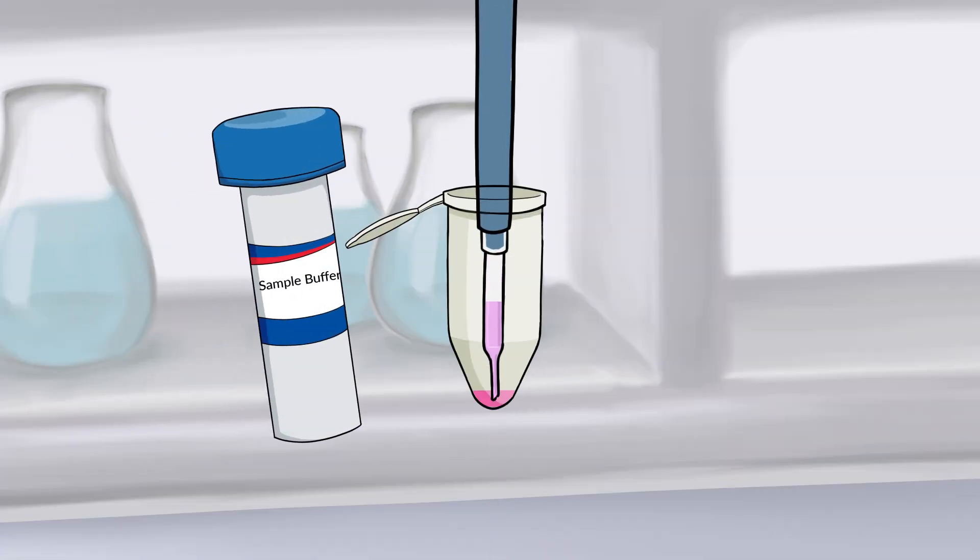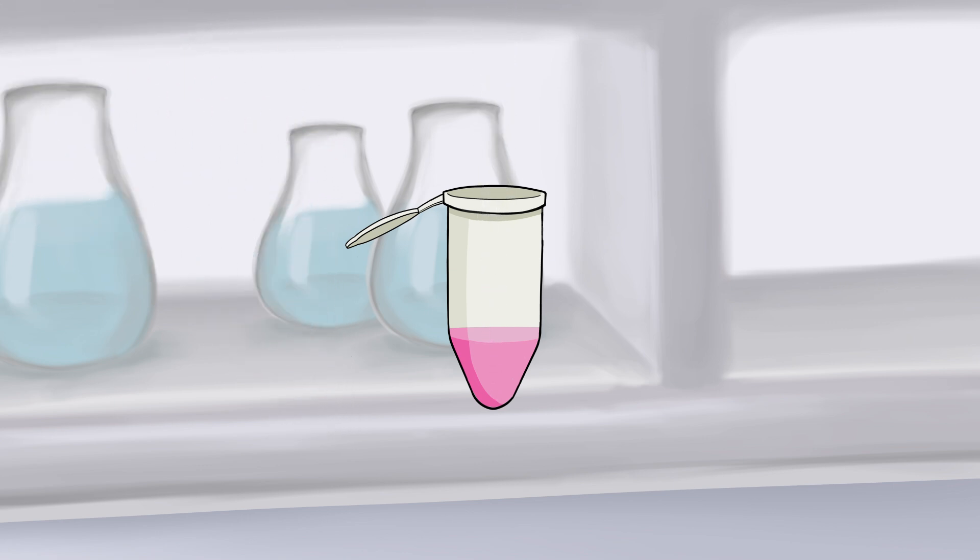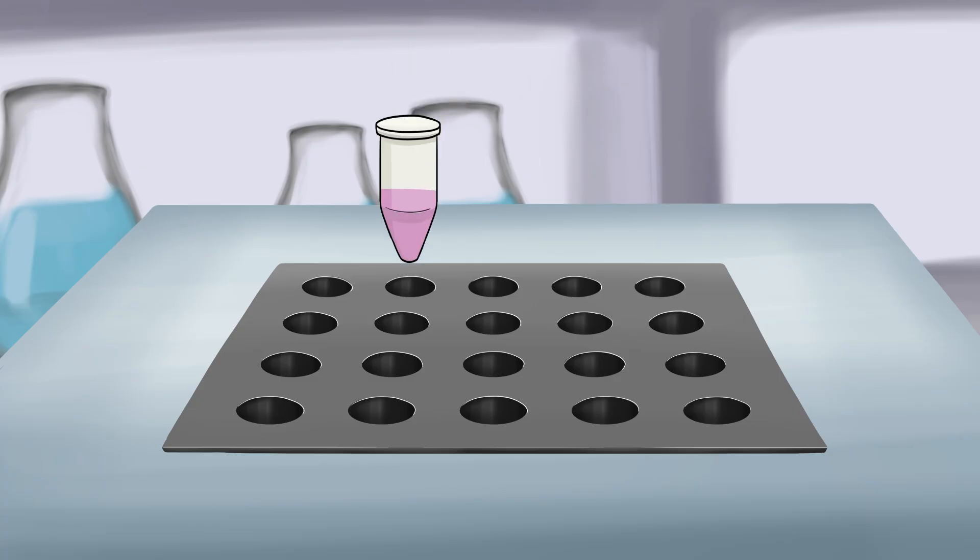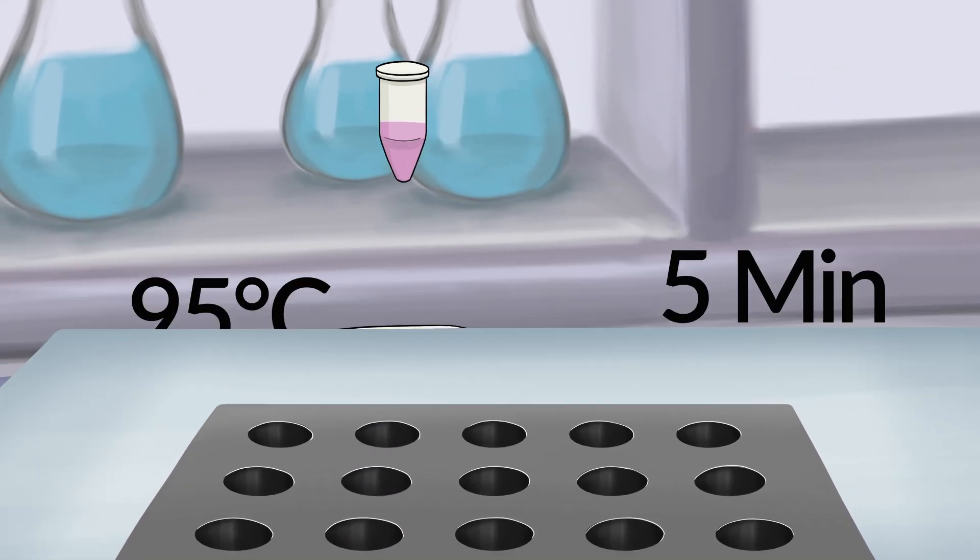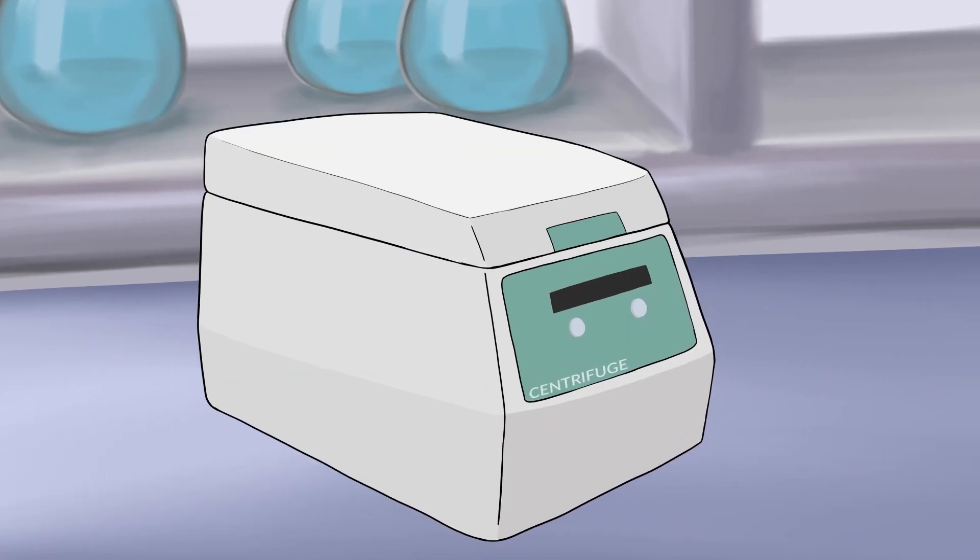Now add 100 microliters of sample buffer to the tube. Mix it well by pipetting up and down 3 times. Heat the sample at 95 degrees Celsius for 5 minutes using a heat block or a thermocycler. After heating, centrifuge the sample again at 14,000 G for 2 minutes.